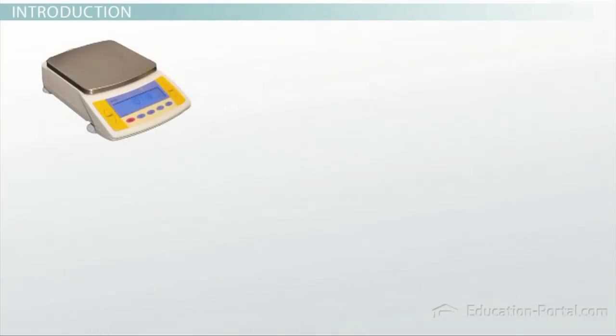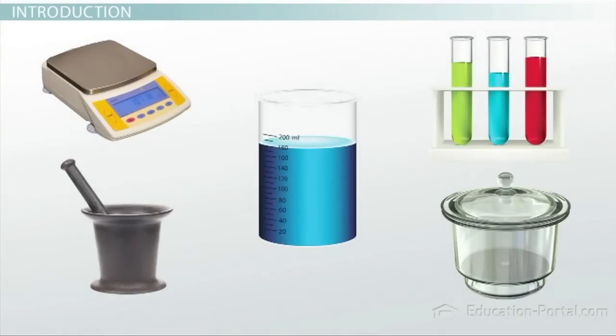So come on this journey through the chemistry lab, where we are going to see what types of equipment it would take to make a saltwater solution, and then measure its density.